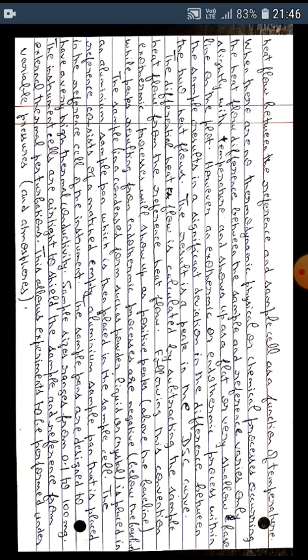When there are no thermodynamic, physical, or chemical processes occurring, the heat flow difference between the sample and reference varies only slightly with temperature, and it shows up as a flat or very shallow baseline on the plot. However, an exothermic or endothermic process within the sample results in a significant deviation in the difference between the two heat flows. The result is a peak in the differential scanning calorimetry curve.